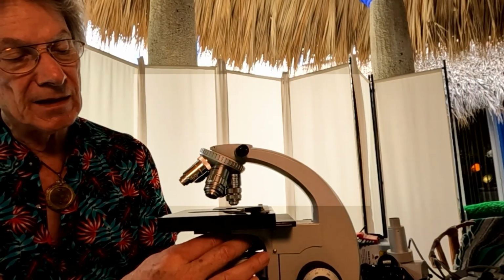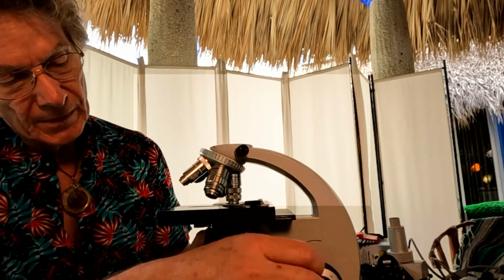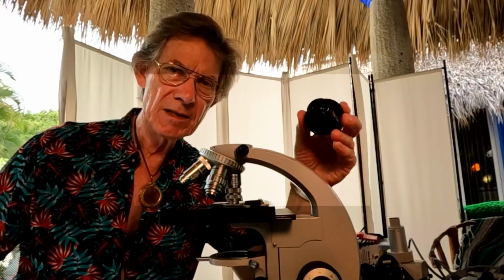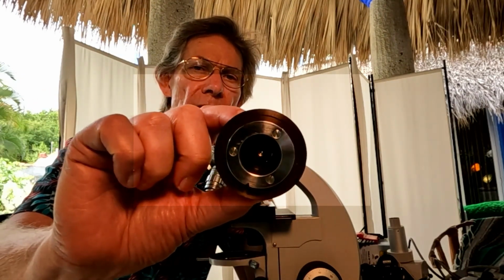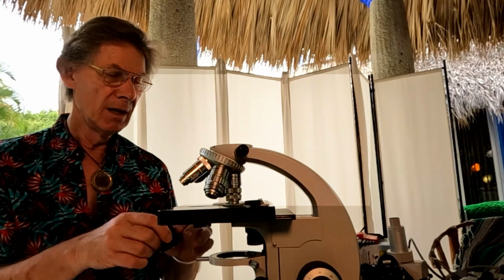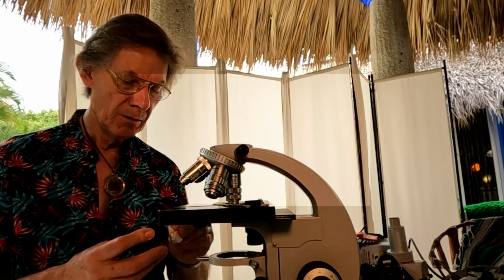The condenser is the thing that condenses the light. Why do we want it condensed? Well, we need a lot of light in this technology, and I'll talk about the condenser. This is an ultra dark field condenser, and it's a very special technology. If you look in the bottom, I don't know if you can see that, but there is a silver ball in there, which is actually a round mirror that reflects the light in a very special path up to the specimen, which is the blood on a microscope slide.